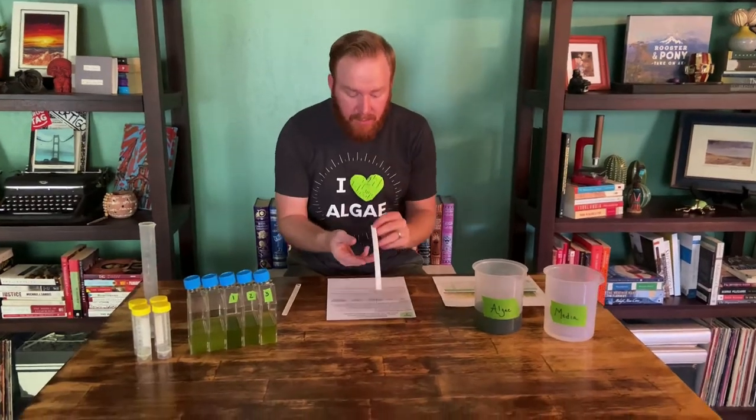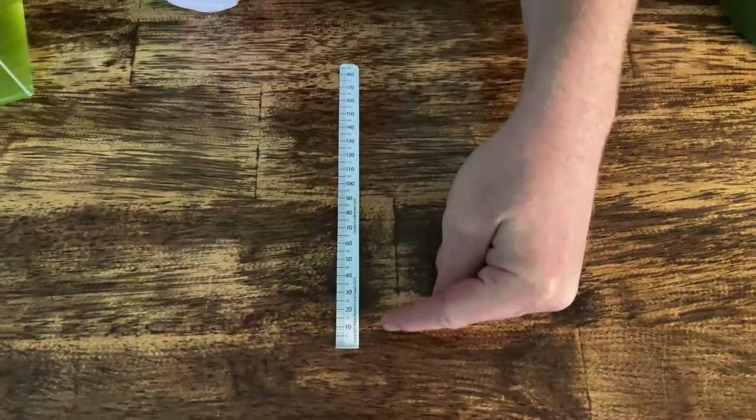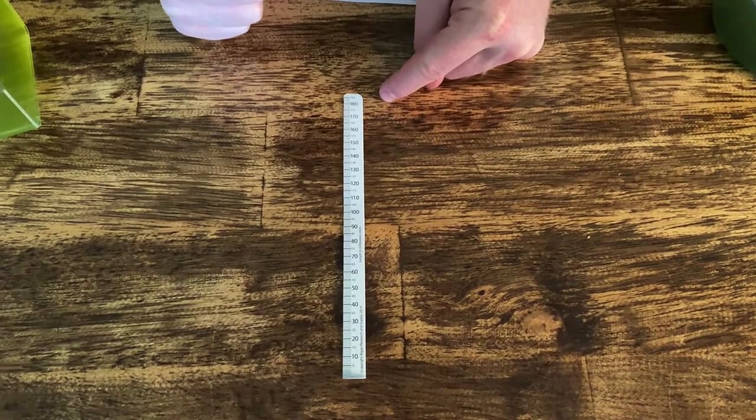So first, let's go ahead and use the SecchiStick. The SecchiStick is two different pieces. It's a long L basically, and this side is a ruler. It starts down at zero millimeters and it goes all the way up to 185 millimeters.